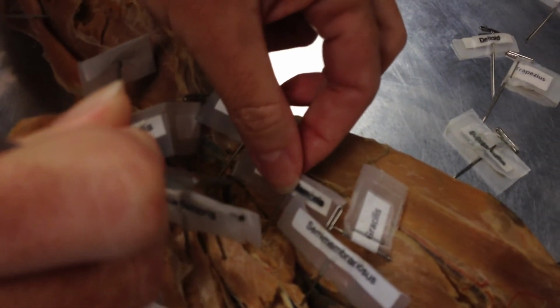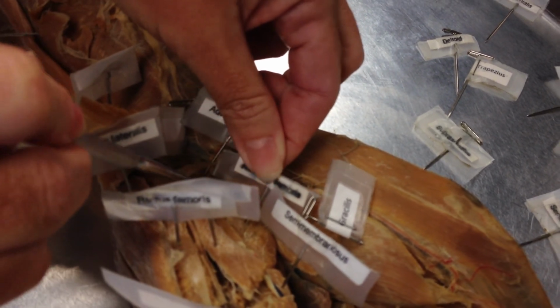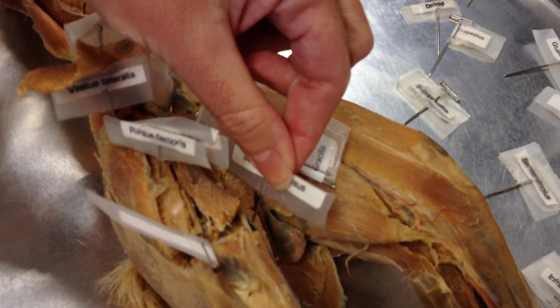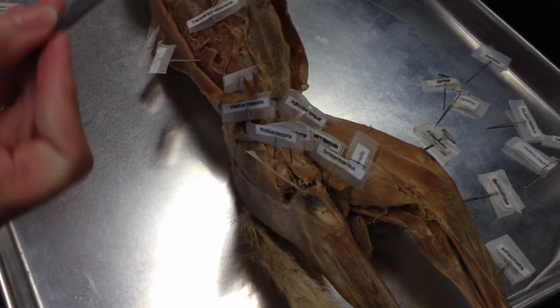It's this band right here. And then adductor femoris, which is usually split into 2 parts. Okay? It's rather large, adductor femoris. And then this is our semimembranosus right here. And that is the anterior side of the cat. Right.